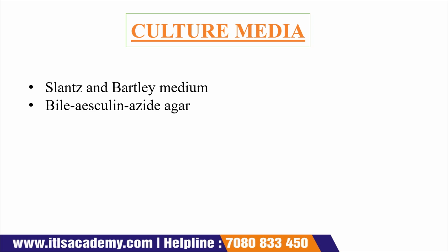Now, culture media. We use two culture media. One is Slanetz and Bartley medium, and another one is bile esculin azide agar.